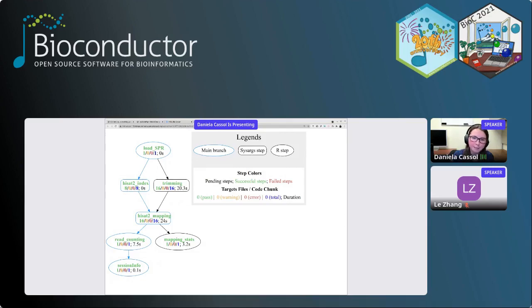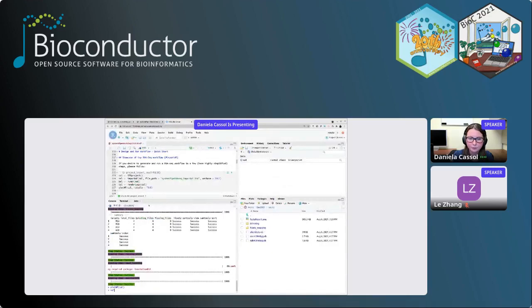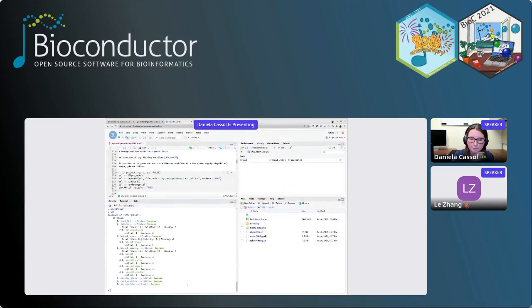Those files were created. And then the time also, how long it took to run that particular step. Okay, and another cool feature we can do: if I print again, you can see here everything is green now. So we are not missing any files, and all the steps are success.